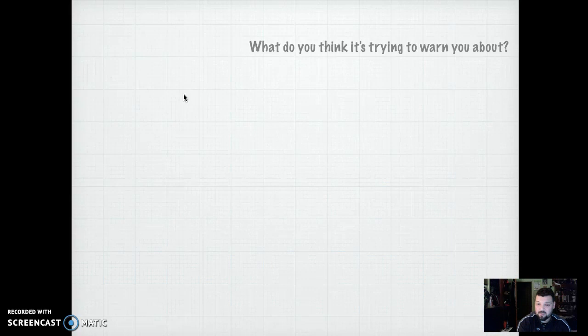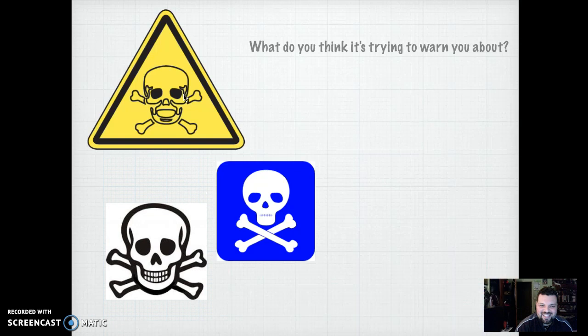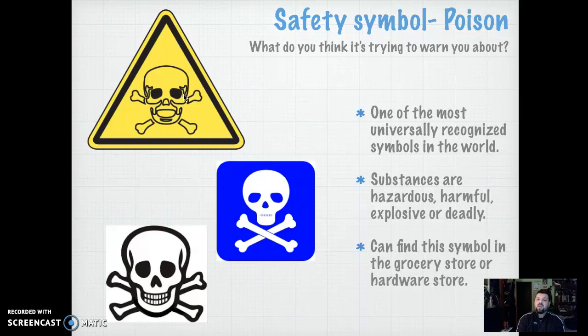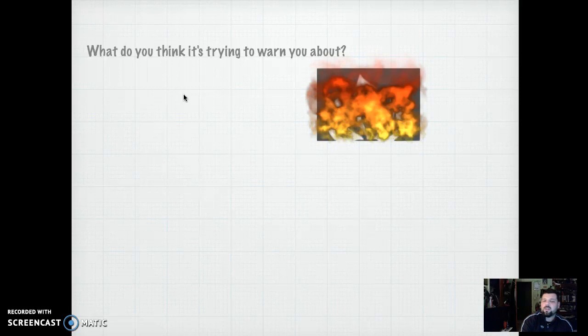Let's take a look at this one — it's really popular with kids when they do their projects. This is not the pirate symbol, but this is the poison symbol. We see this one at home in our cleaners, our detergents, in the Home Depot section. This is one of the most universally recognized symbols in the world. It means that you are dealing with a hazardous, harmful, or even explosive, poisonous chemical. This one speaks for itself — we see it all the time, everywhere.